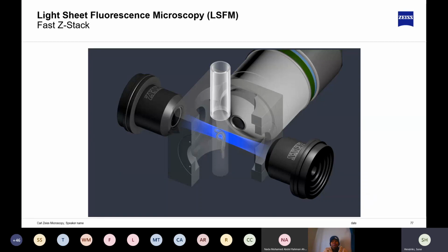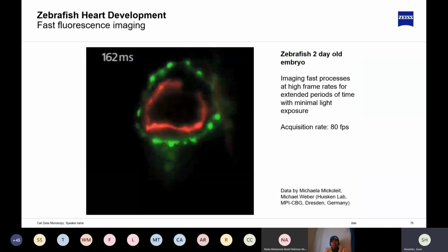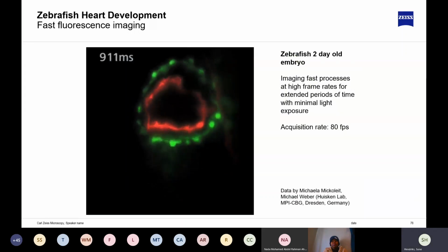Due to the design of the light sheet microscope, the sample is suspended in water or other medium and is moved through the sheet of light as you image it. The selection of the aqueous solution is very advantageous, and water is a very stable medium due to its high specific heat capacity.